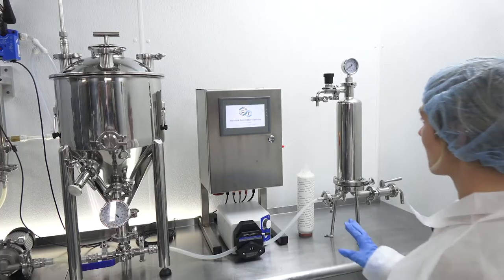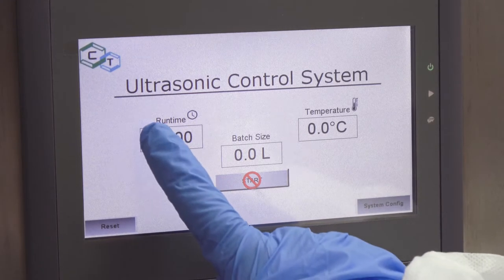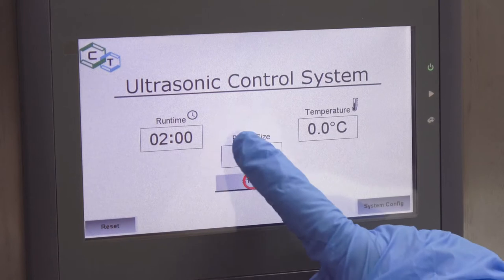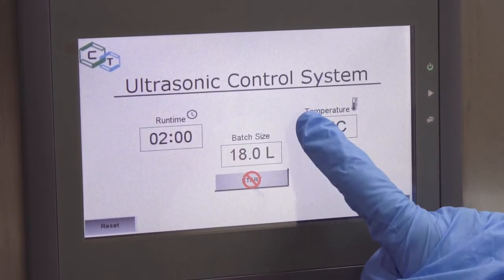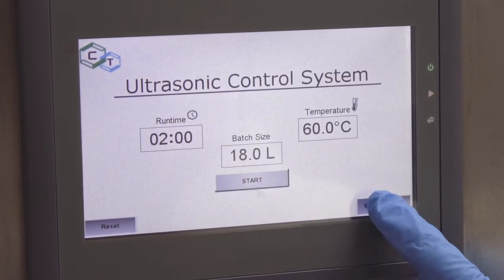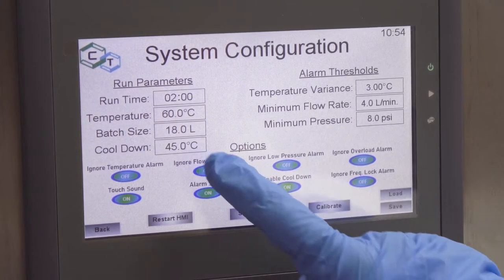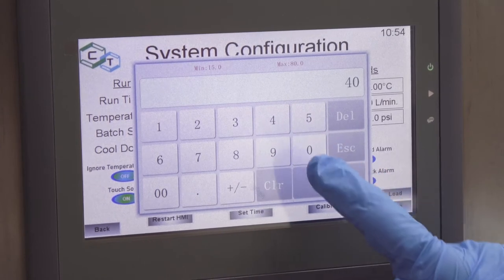Now we're ready to sonicate. After ensuring that our chiller, pump, and CT2000 are powered on, we input the batch parameters into the IAS2100 Touchscreen Automation Controller. We specify a 2 hour run time, 18 liter batch volume, and 60 degrees Celsius processing temperature. We'll also enable the cooldown function, which enables the system to cool the batch to a pre-selected cooldown temperature after processing is complete.